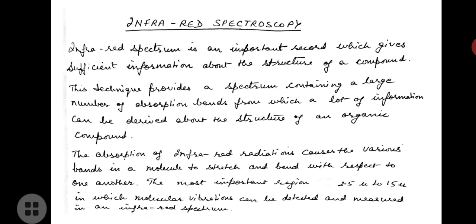Thus, these are responsible for absorption of energy in the infrared region. On the other hand, the vibrational transitions which are not accompanied by a change in dipole moment of the molecule are not directly observed, and these are infrared inactive.